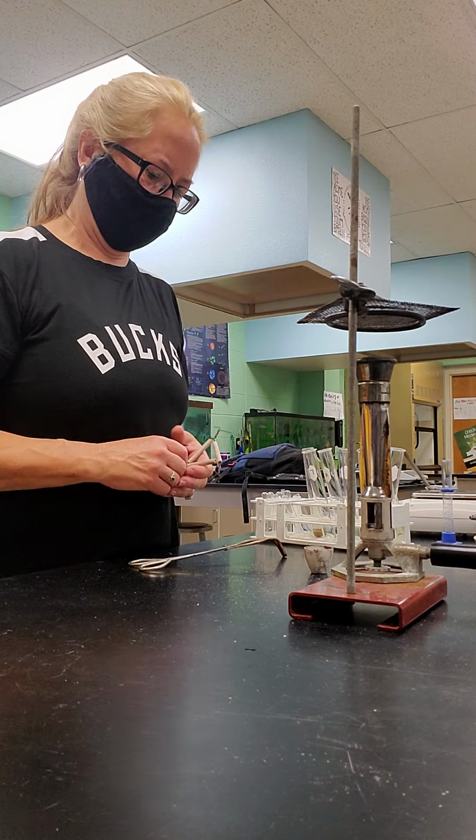So the original mass was 0.44 grams. The mass now is, I didn't dry it all the way, 0.43 grams. So it lost some mass. Well, where did that mass go? It actually reacted with the silver nitrate, and so the silver precipitated, the copper became part of the solution.